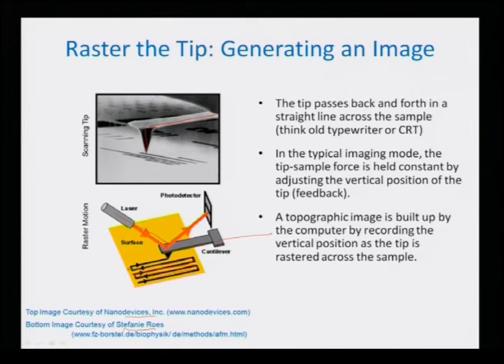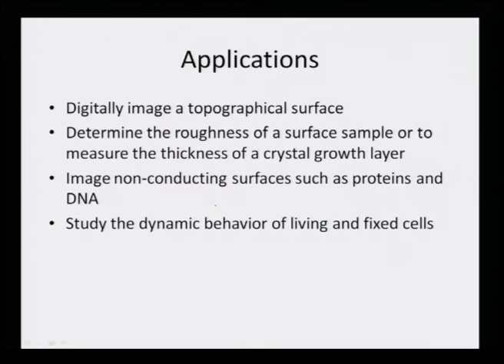which is shown here as it rasters on the sample surface, and every time its position can be detected by using a piezoelectric device rather. And the tip position can also be detected by this. If you store all the data in a computer, later on you can plot the deflection of the tip as a function of the distance, or the spatial coordinates, and get the image.